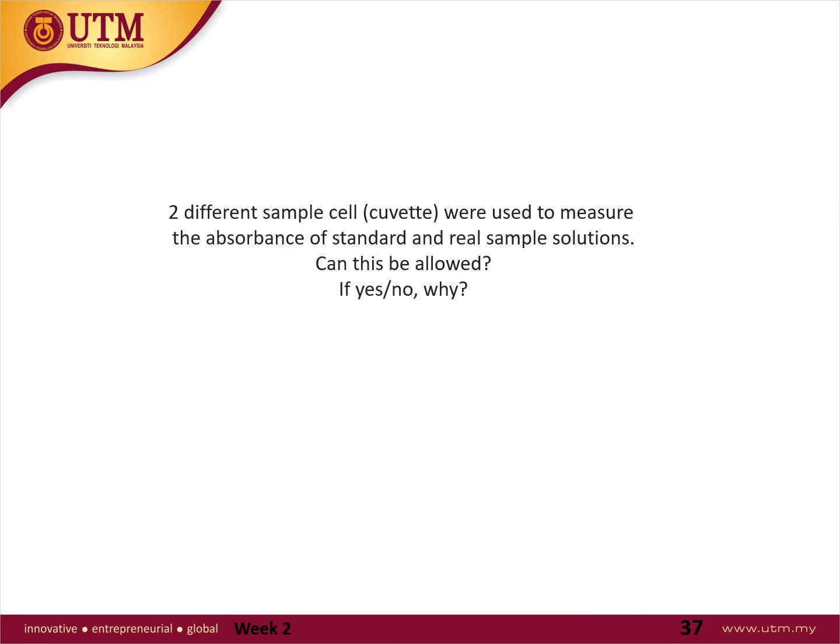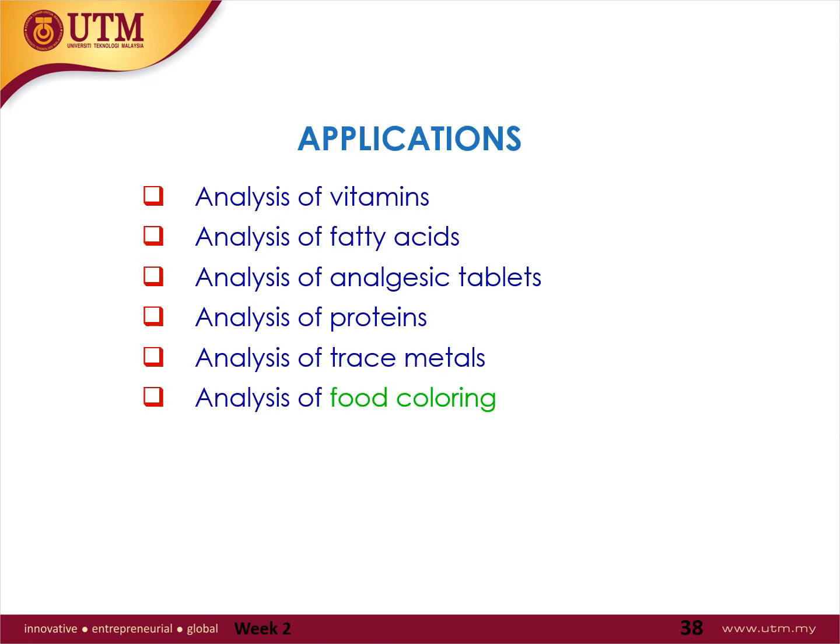Okay, so two different cells were used to measure the absorbance of standard and real sample solution. Can this be allowed? So you can discuss with your friends and put your answer inside the WhatsApp group. Okay, now we go to the last part of UV visible spectrometry.